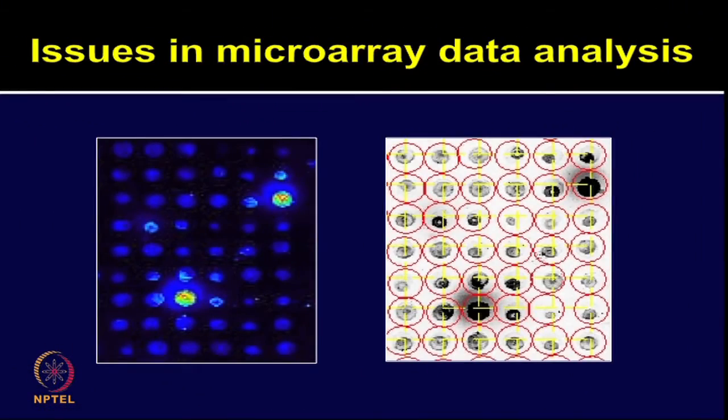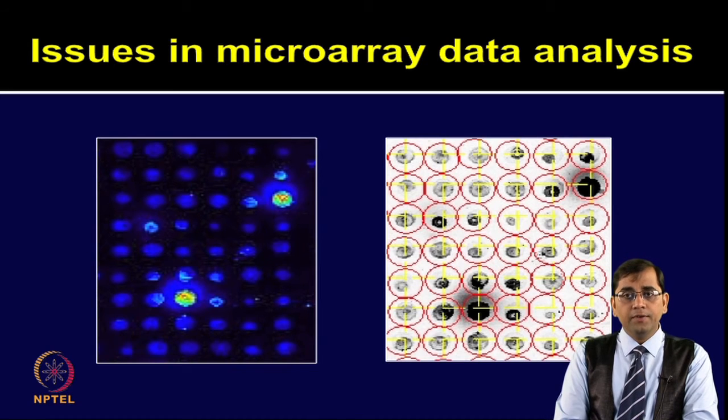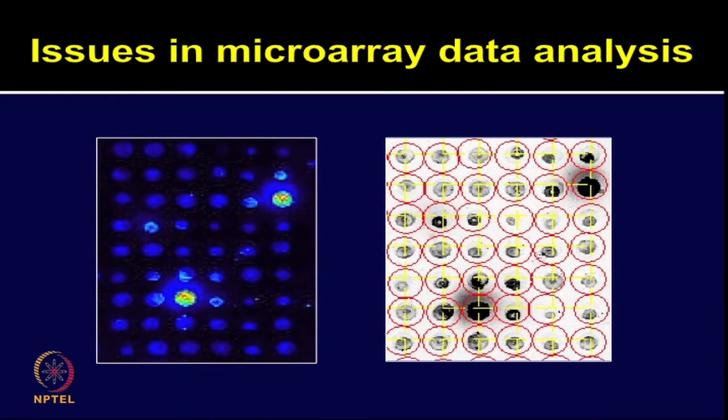However, while scaling up, especially when you are using cell-free expression based approaches, one needs to be cautious about what the optimum intensity for the arrays should be, because if there is a spillover of expressed protein onto the neighboring protein spot, that is going to affect the values of the neighboring spots as well. The slide shows how protein is diffused to the neighboring spots, and the neighboring spots need to be corrected for data analysis. Similarly, one needs to perform background correction, normalization, and use various parameters to perform good microarray data analysis.